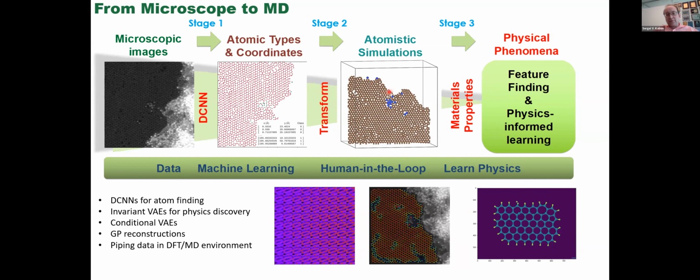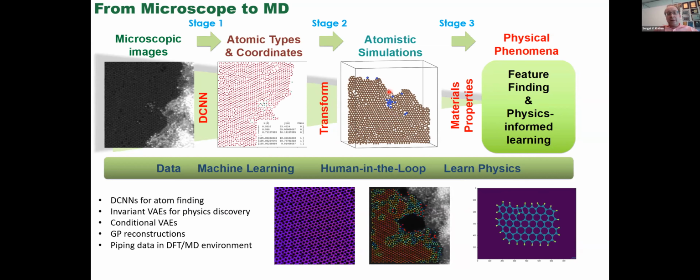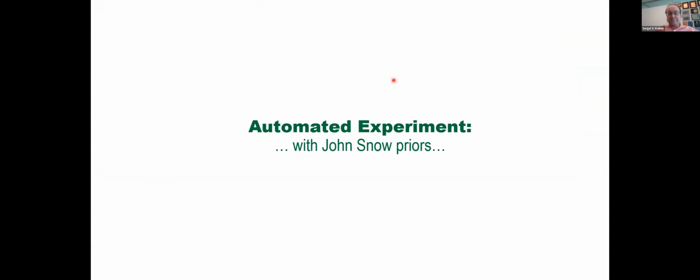That's kind of the point where it stopped a little bit, because the microscope can generate the data every 100 milliseconds. A neural network can analyze it in the same amount of time. However, if we pipe this data into the atomistic simulation, those take much longer. So now we said that, look, we can deliver the structural data to the HPC, but now it's up to theorists to figure out how to analyze it fast enough. But this is all enabled for the case where we know in advance what we want to study.